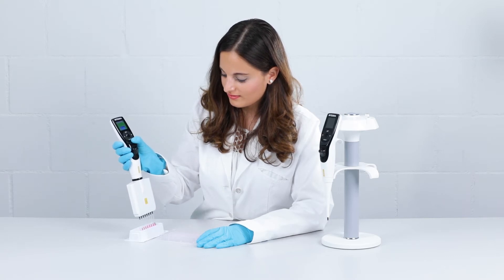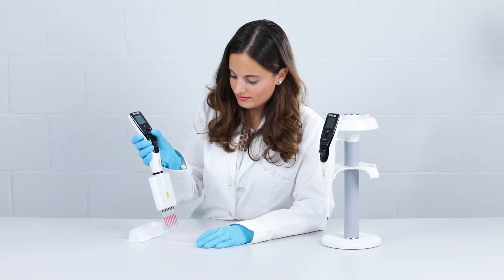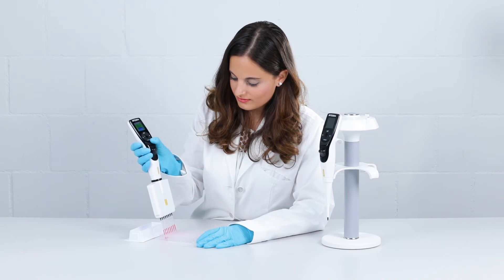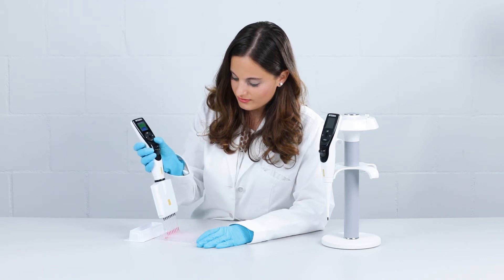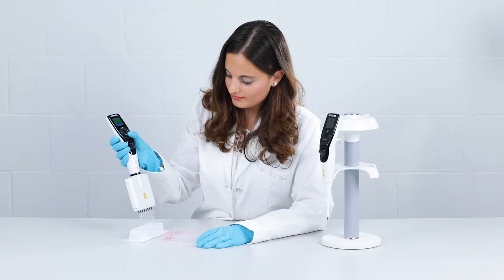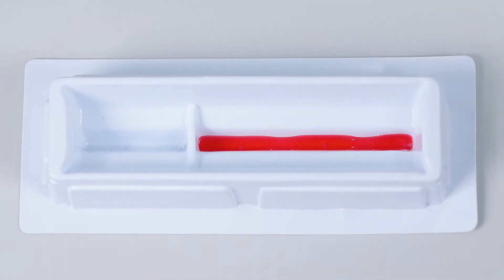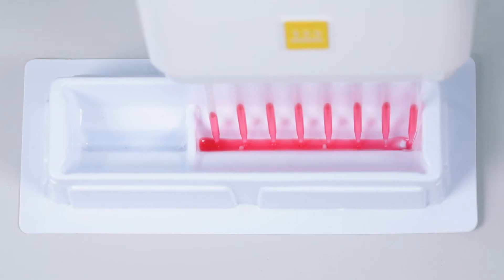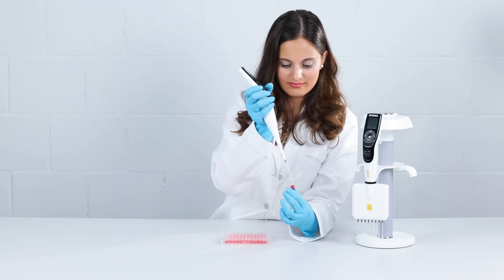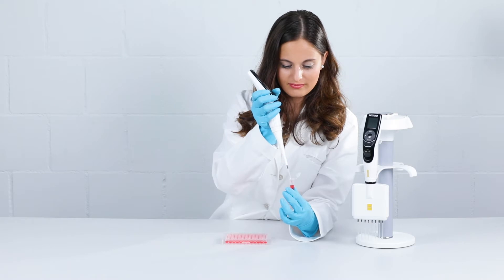Using standard multi-channel pipette reagent reservoirs can result in the loss of expensive master mix or precious samples. At low volumes, liquids tend to form small pools and the pipette might aspirate air, wasting reagent. This can be avoided.